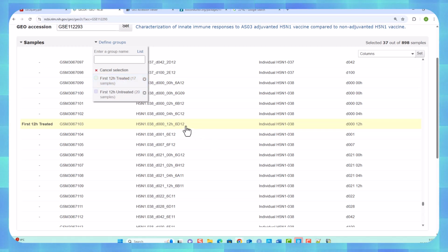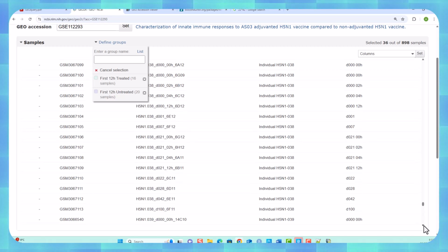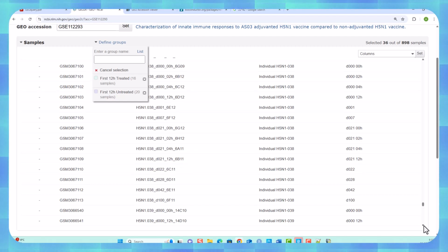Or I can leave it in and see if that's exactly what I thought. I want that one. Yeah. I'm going to take 38 out because I don't trust that data. I'm pretty sure that's the second after the boosting that they collected it, and that's why there's missing ones. There's not 924, there's only 898 because they missed that set of data. They've got to have missed it on another person as well.